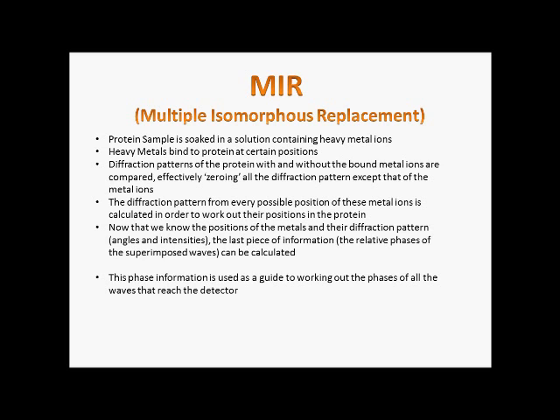Because metal ions produce such clear diffraction data, and because there'd only be 2 or 3 of them in the molecule, it's possible to estimate their phases just by plugging in possibilities of where they could be and seeing what the diffraction data for that would look like. This is helped by the fact that when you do your Fourier transform, you have the constraint that all electron density has to be either very great or very small, because unless you're in the electron field of an atom, there is no electron density. Also, if you get any major negative values for electron density, you know this position is wrong because that's impossible.